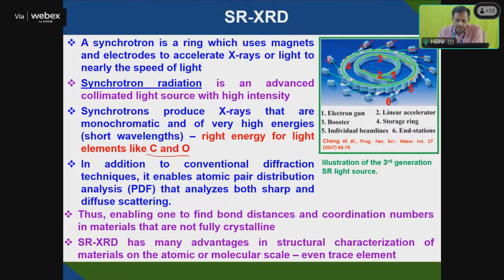In addition to conventional XRD, you get pair distribution analysis. This is information you obtain through a particular analysis in the software.